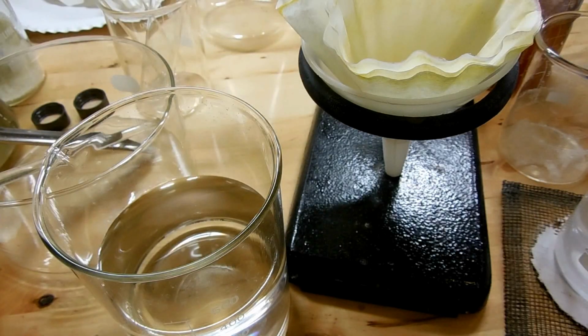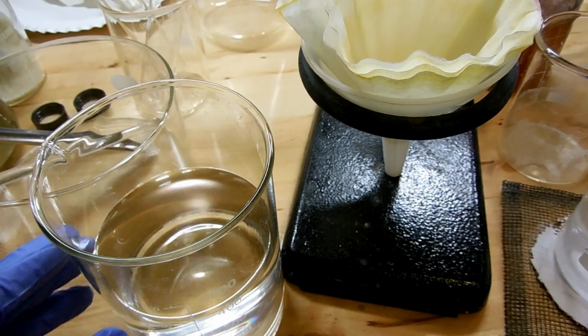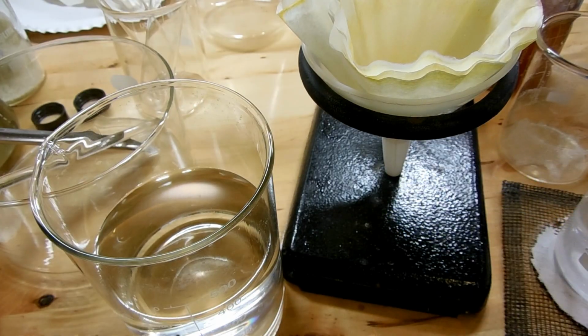So now we need to consider cleanup and disposal. Every solution that contained a lead salt, like this was our mother liquor, every container that came into contact with a lead solution or a lead salt, like this thing, my stirring rods, the filter paper, the funnel, all of that needs to be effectively neutralized because we want to get rid of this lead. It's not good to keep that around.